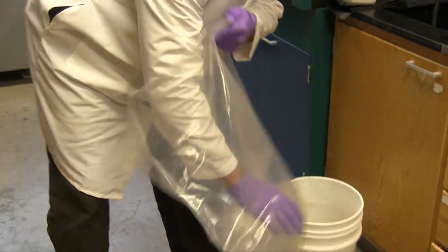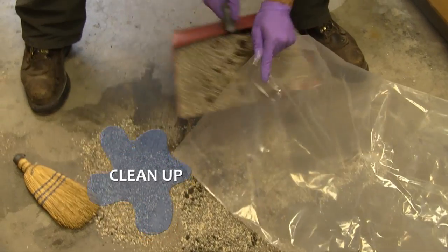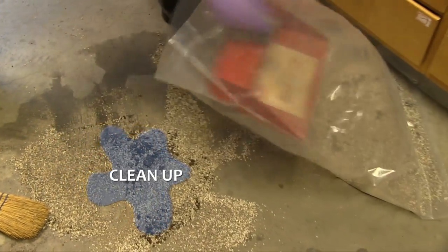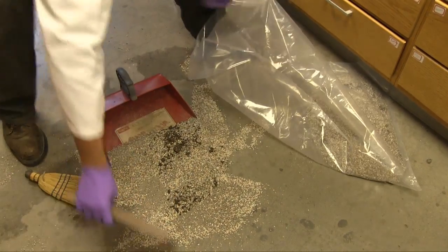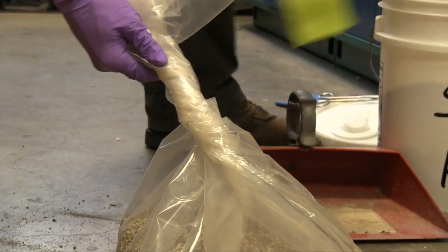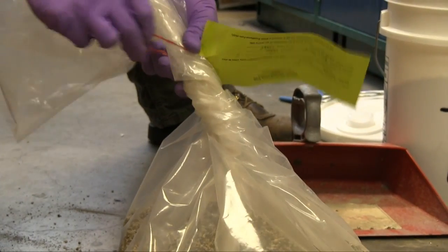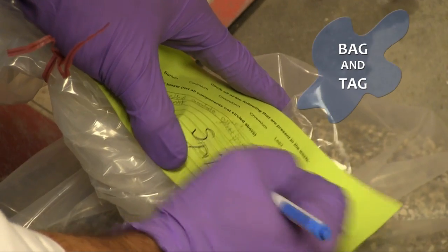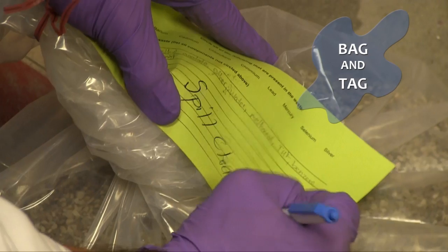Put the used floor dry into a plastic bag. Attach the green label removed from the broken bottle to the bag of cleanup material and label it as spill cleanup material. Once finished, contact your lab supervisor and Environmental Health and Safety as needed.